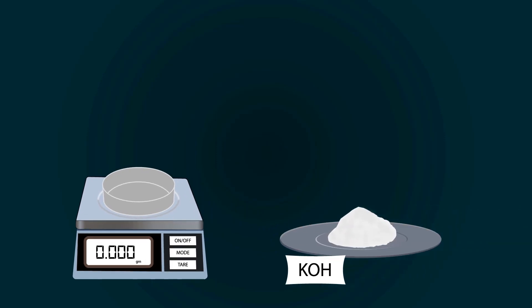Now start adding potassium hydroxide into the petri dish with the help of a spatula. Weigh precisely up to 5 grams.